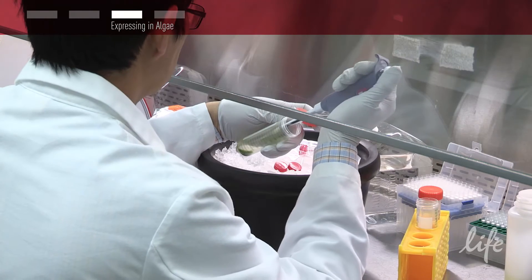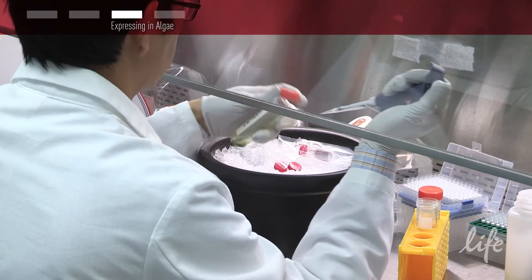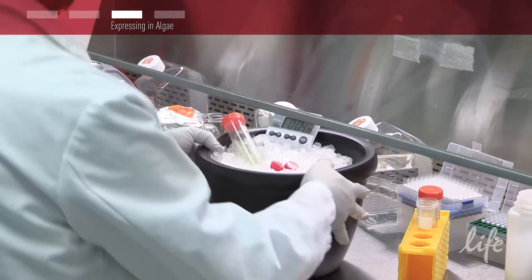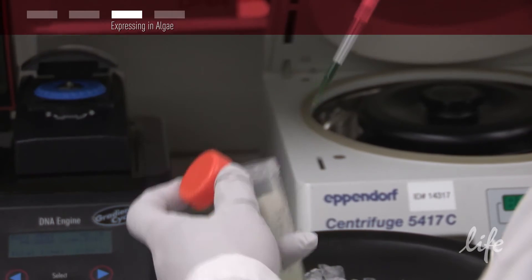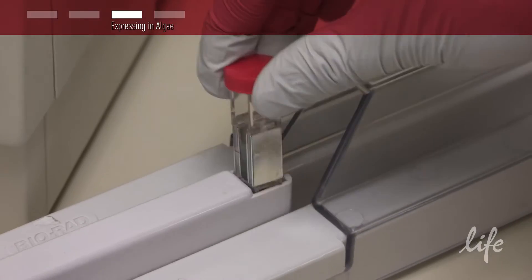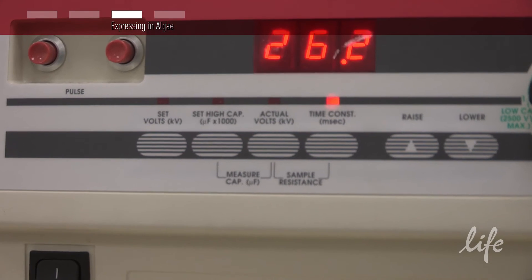For electroporation, place cells on ice and then add 1 microgram of linearized DNA per 250 microliters of cell suspension. Electroporate at 500 volts, 50 microfarad capacity, and resistance set at 800 ohms for about 30 milliseconds.